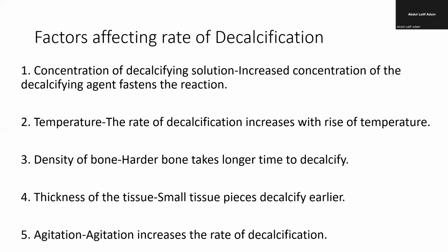Okay. So now let's look at some factors that affect decalcification. From what I have said, you can notice that the concentration of the decalcifying solution can influence whether there will be fast decalcification or not, or there will be distortion of the tissue or not.